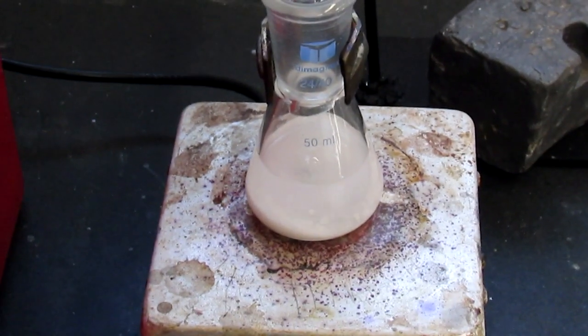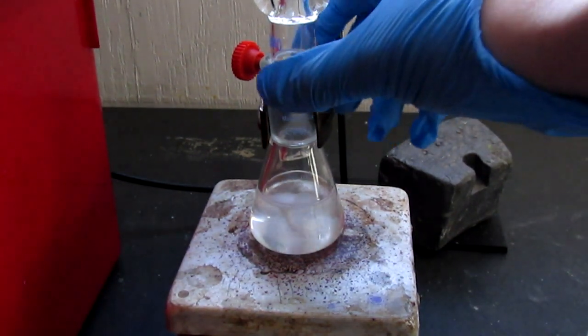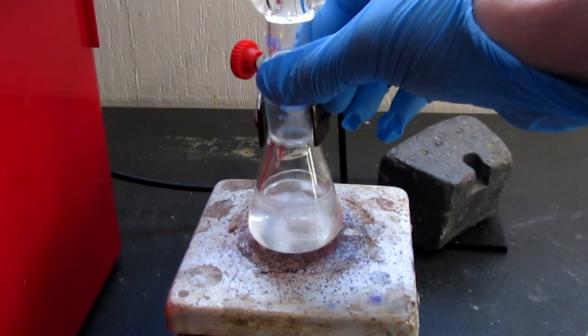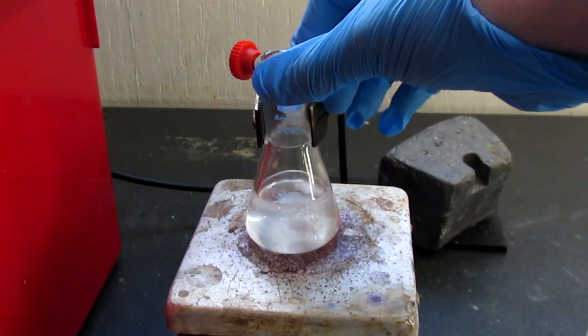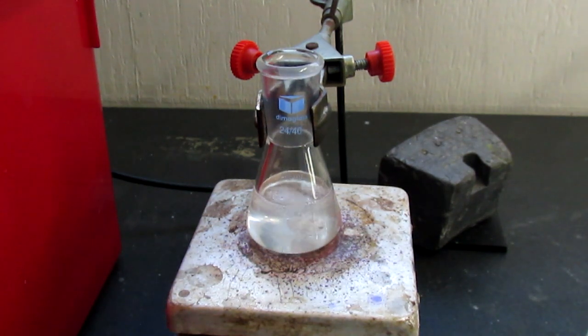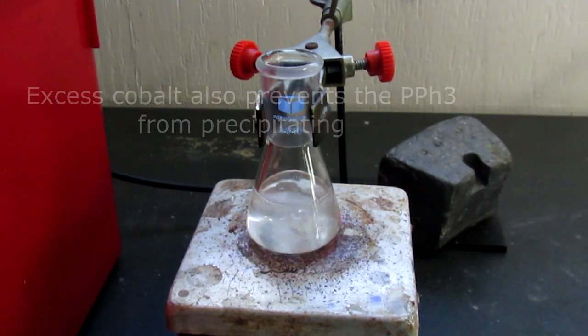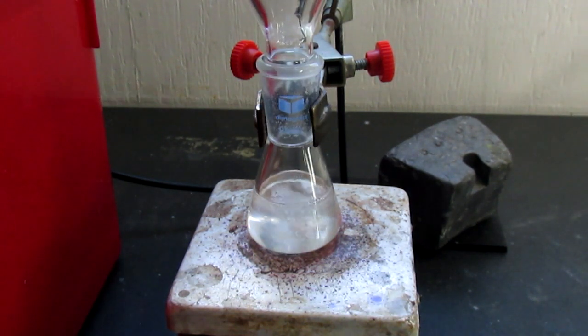The triphenylphosphine is now all dissolved, so now I'm going to add 2 grams of cobalt chloride hexahydrate. This is a slight excess, but you want to conserve the triphenylphosphine as much as possible. Alright, in it goes.